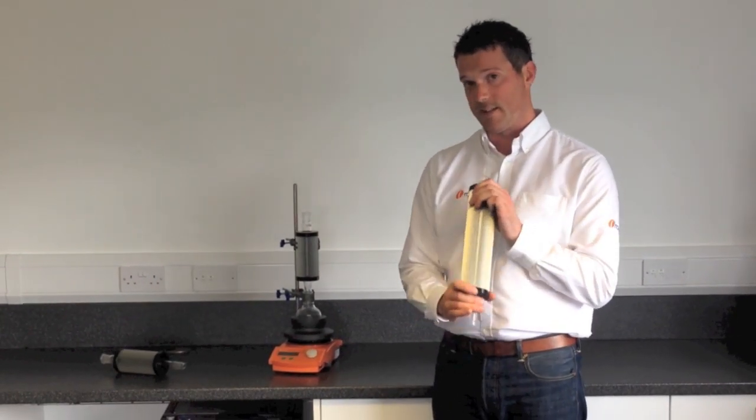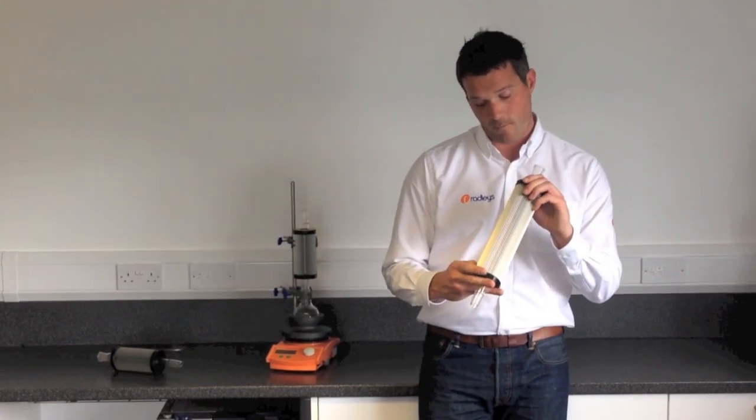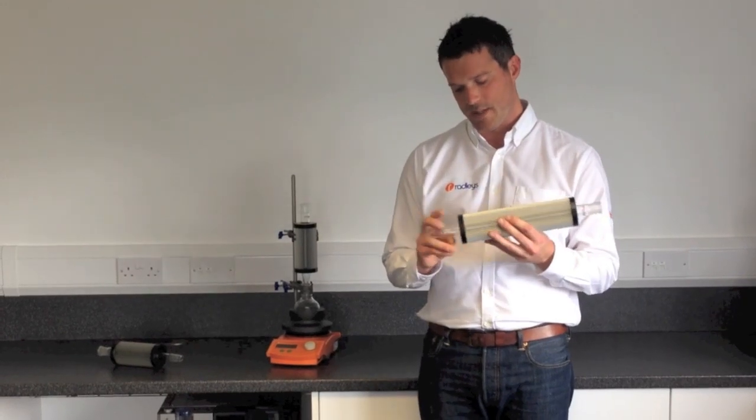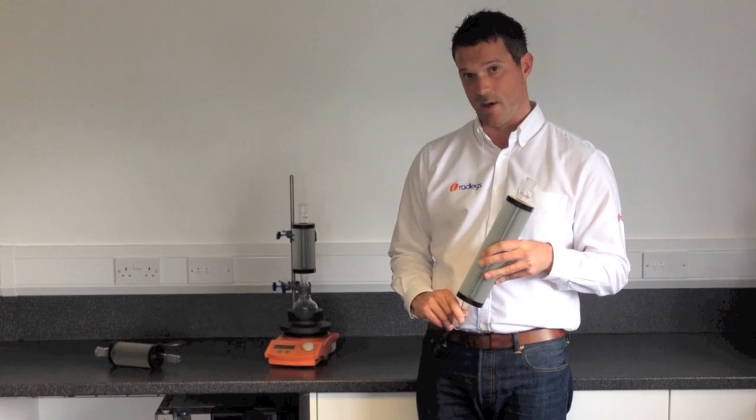This one is the standard Thindenser. It's 400mm long. It's good for a flask size up to 2.0L with 1.0L of solvent in. It comes in the joint sizes B19, B24 and B29.